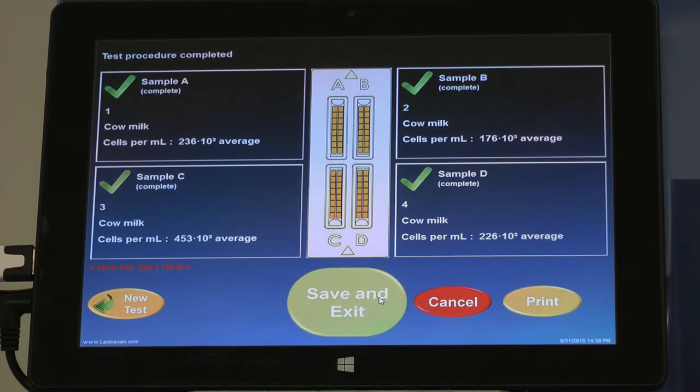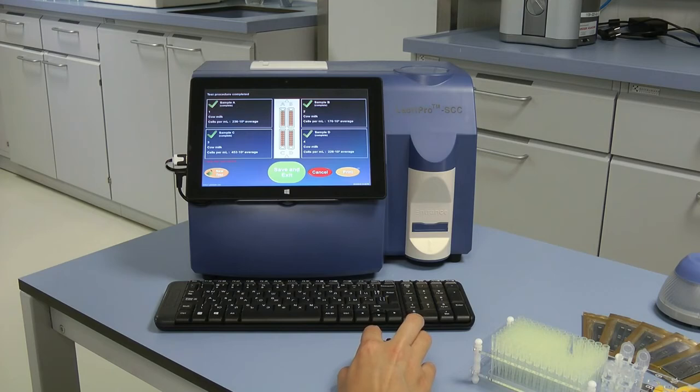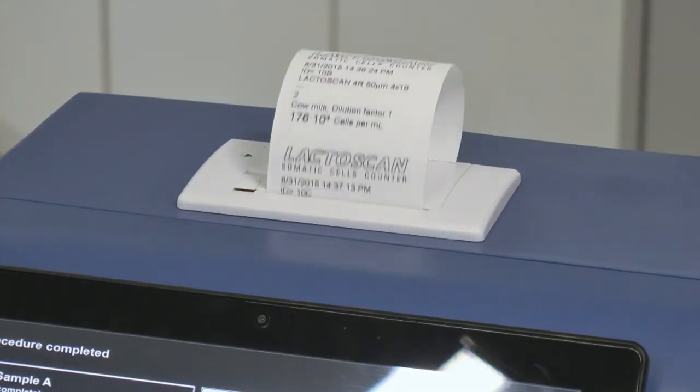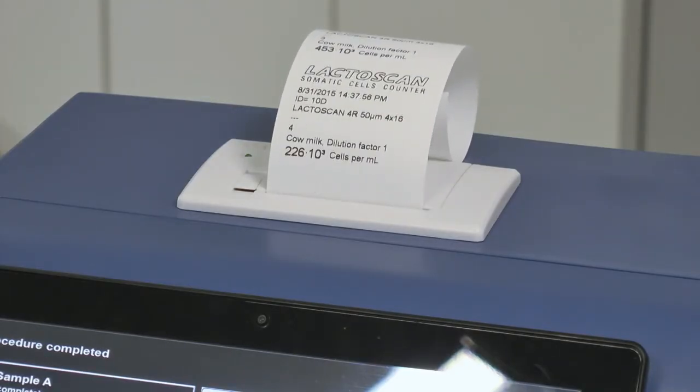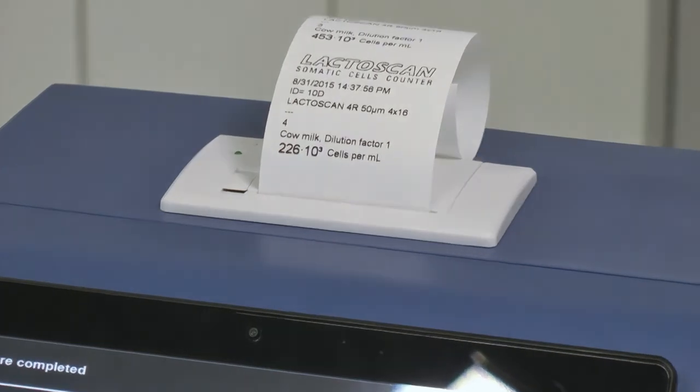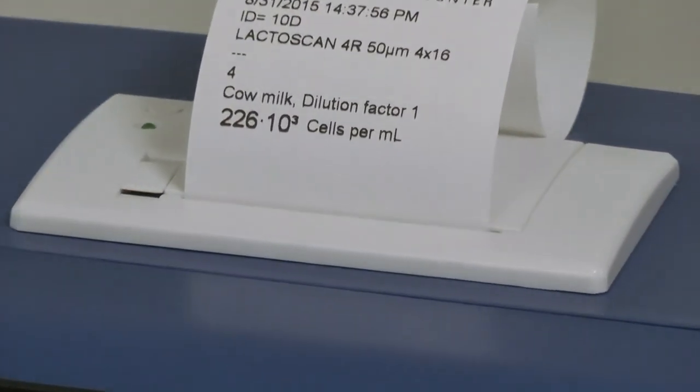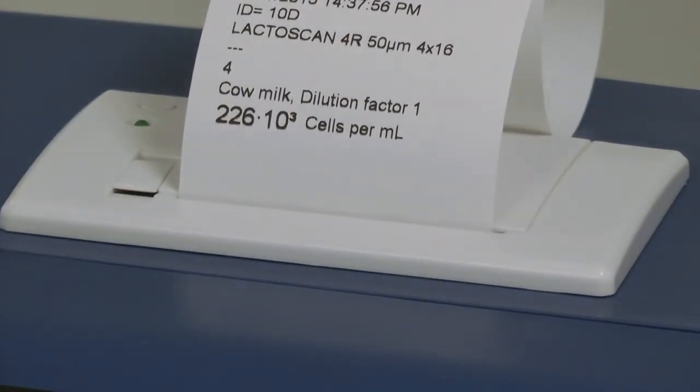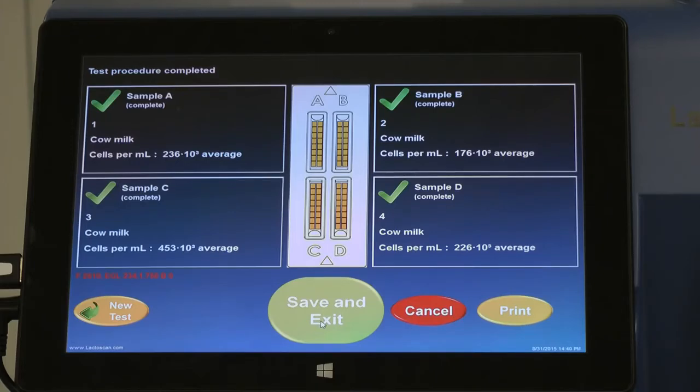When ready, in order to print the results, press Print. It is not necessary to choose a printer or form of printing. By default, it is accepted that LactoScan will print the results on the integrated printer in a short form. Your results are now printed. In order to save the results and continue, press Save and Exit.